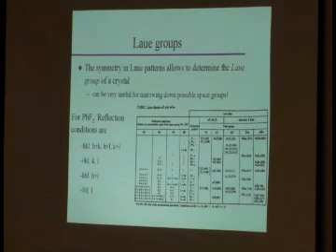If you look at the two symbols, m3bar and m3bar m, the second symmetry direction really doesn't allow us to distinguish these two Laue groups, right? Because it has the same entry. The first and the last is what allow us to distinguish it. So the first one is either a 2/m or a 4/m. So they are already different. The 100 is already different in these two Laue classes. And then one of these Laue classes has no symmetry in the Laue patterns along 110, while the other one has 2/m symmetry along the 110. That's how you read these symbols, okay?